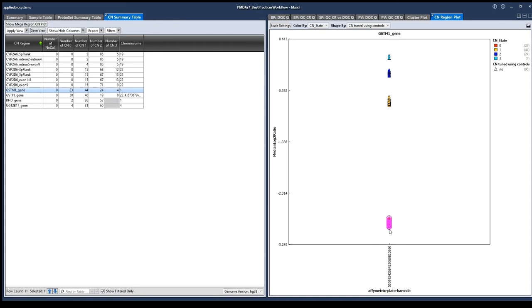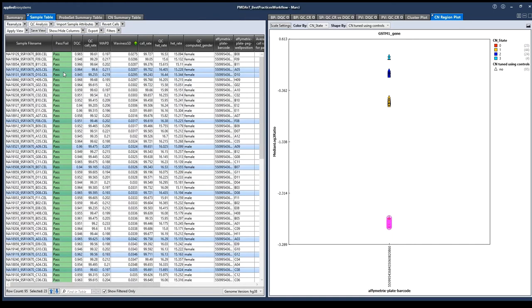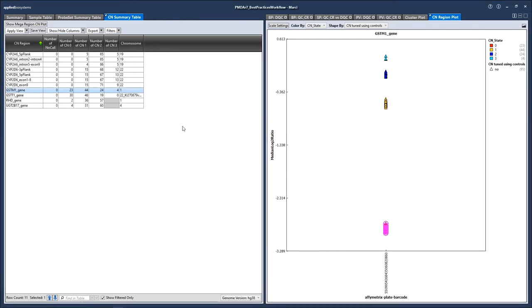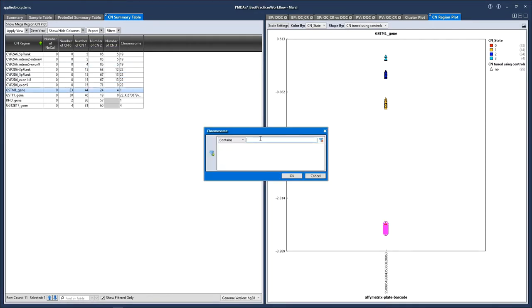I can click on a single sample to select it or hold down left click on my mouse to circle a group of samples. When I select samples in the CN region plot, those rows will then be selected in the sample table. In this data set, I'm only looking at one array plate on which 96 samples can be run. Its array plate barcode is shown here. If I had batch data from several plates, all plates and their barcodes would be shown lined up along the x-axis. In the CN summary table, we can right click on any column to sort, filter, or copy the column — for example, filtering by chromosome 19.